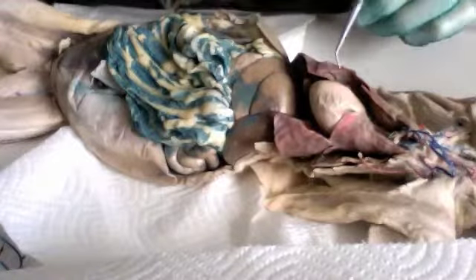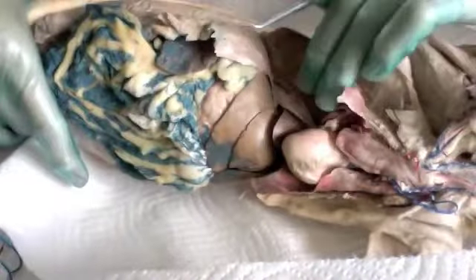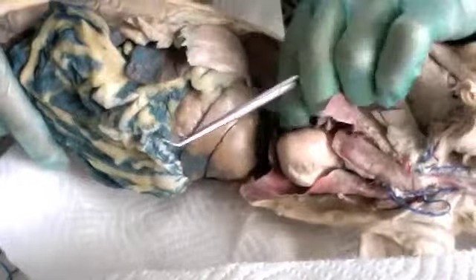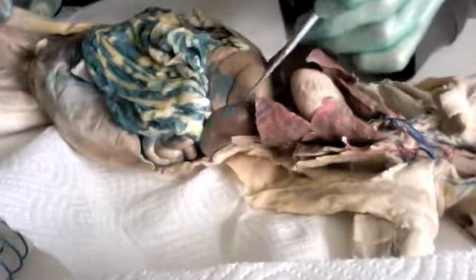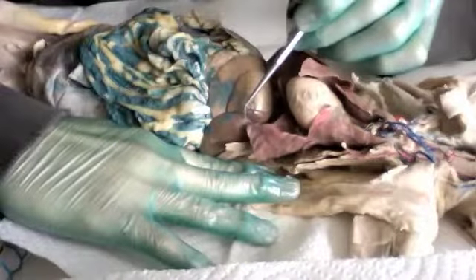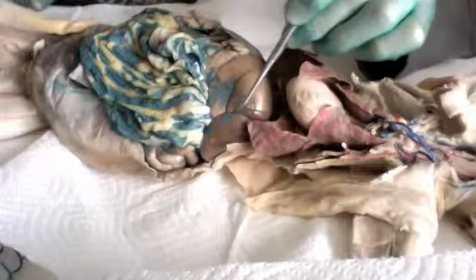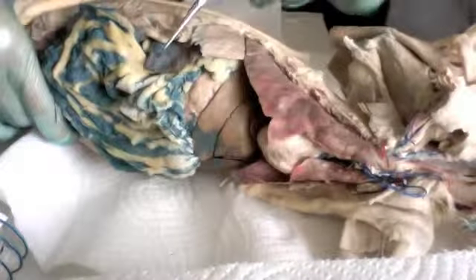And then we have the falciform ligament, which I'm going to see if I can show you here. Falciform ligament's in the back here. It's right there. You can see it. It's on top of the liver pretty much. And then the gallbladder. This is the gallbladder. Right there, that little guy right there is the gallbladder. And then we have the spleen, which is located here. This is the spleen right here.